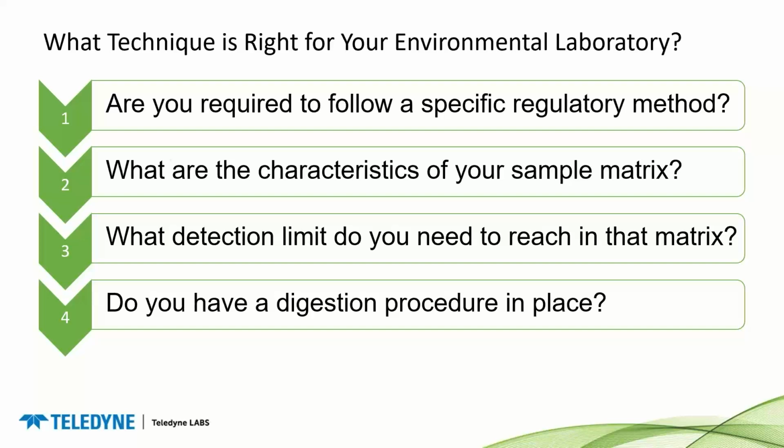But what technique is right for your lab? So selecting the right technique ultimately depends on your specific analytical needs. For many laboratories, especially those in the environmental sector, the decision will be driven solely by the need to comply with that specific regulatory method. Each method states what technique is required or acceptable. But if your lab is not required to follow a regulatory method, then the driving force for your decision will more likely be the characteristics of your sample matrix and what detection limit you need to reach. And sometimes it also matters if you have a digestion procedure in place. So that's another thing to consider.